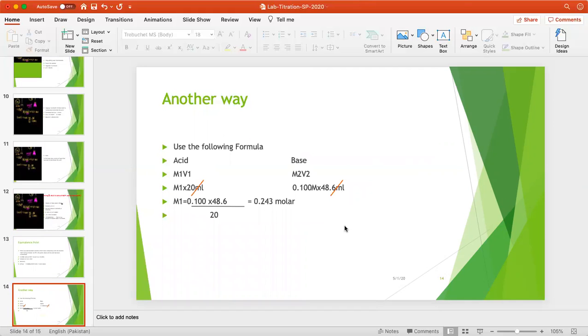So there is another way which is very easy, और मुझे पता है कि आपको ये बात समझ आ जाएगी. इसमें आपको कन्वर्जन्स करने की भी जरूरत नहीं है, लेकिन आप ये तब करेंगे जब 1:1 रेशियो आप यूज कर रहे हैं, ठीक है. So there is another way. This is the shortcut which works pretty well, but when you are dealing with a strong acid and a strong base in a 1:1 molar relationship, only then you can use this. आपने क्या करना है कि एसिड और बेस लिखना है. एसिड की वैल्यूज है M1V1, बेस की वैल्यू है M2V2. पुटिंग द वैल्यूज ओवर हियर, मिलीलीटर्स के साथ जो है वो कैंसिल हो गए, सो देयर इज नो नीड टू कन्वर्ट इनटू लीटर्स. सो वैल्यूज जब आपने पुट की तो यू गॉट 0.243 मोलर सॉल्यूशन. सो दिस इज द कंसंट्रेशन. दिस इज द ईजिएस्ट वे.